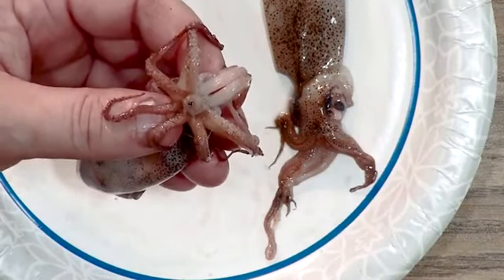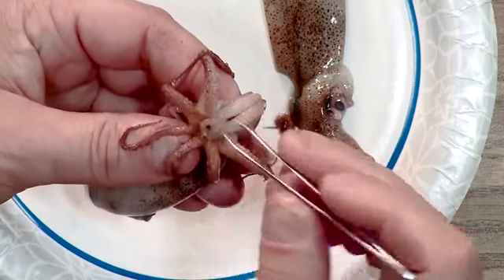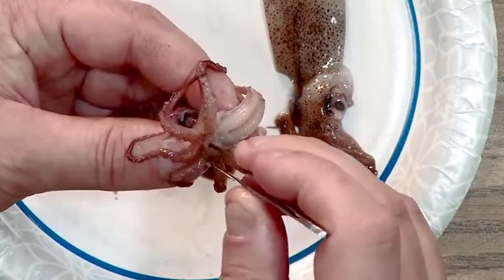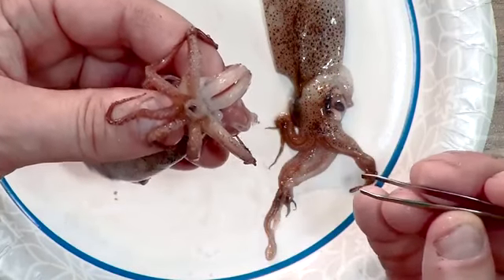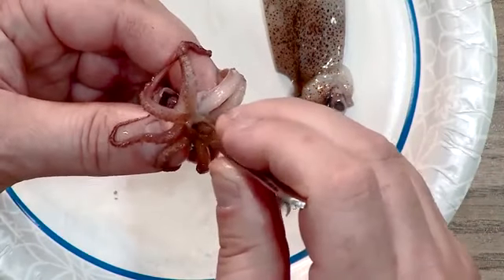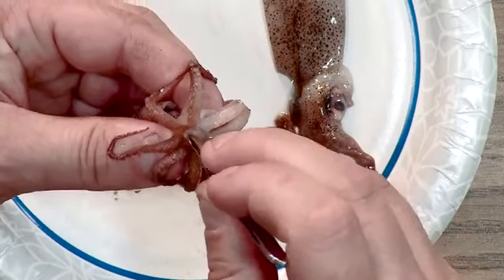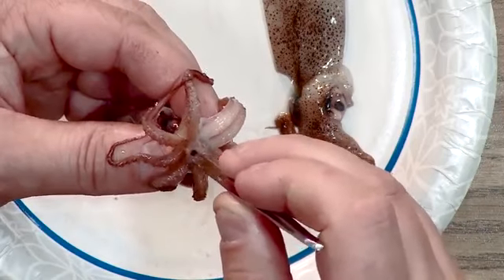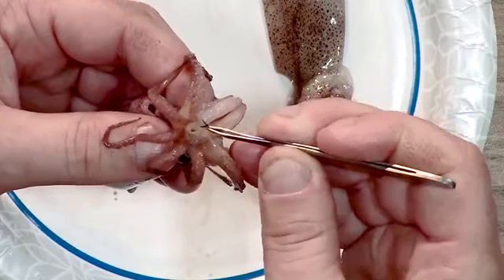Now, inside this mouth area, you can see that there's something black inside there. And this is actually the beak of the squid. This beak is a lot like a bird beak. It's got a top and bottom jaw that come together into a pinch. And I'm going to squeeze this area a little so it protrudes. And I'm going to use my tweezers to open up the mouth here and see if I can grab hold of that beak. Okay, I've got it.